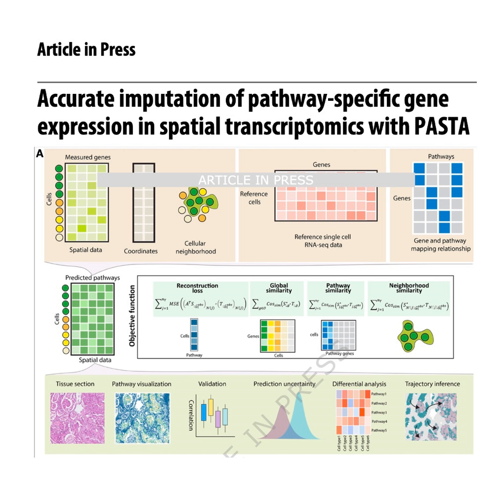And did they? Absolutely. PASTA accurately localized key pathways where they were supposed to be. For instance, pathways associated with tumor cell proliferation, like MYC targets V1 and V2, were correctly enriched right in the tumor cells, specifically in the basal cell population. And what about the immune response? Conversely, immune-related functions, like the inflammatory response, were correctly highlighted in the immune cells, in the T cells and macrophages.